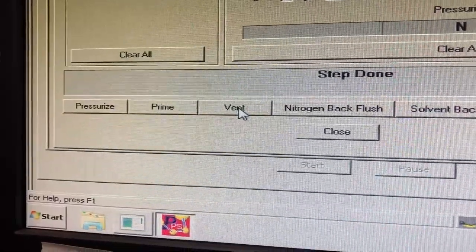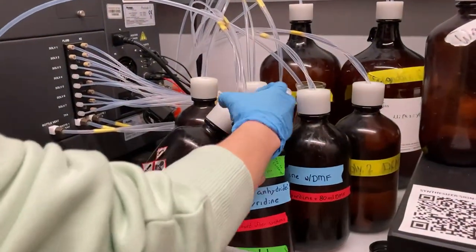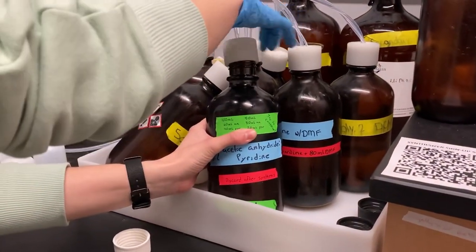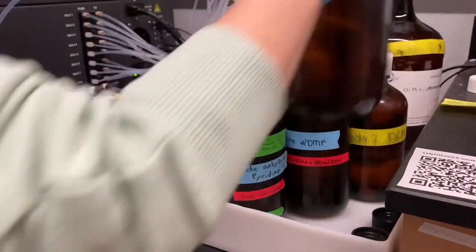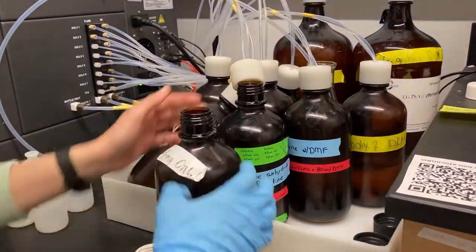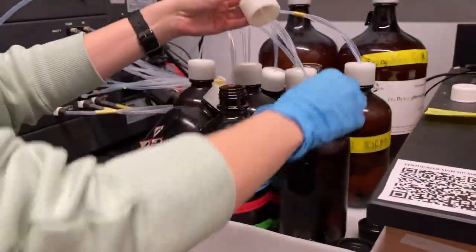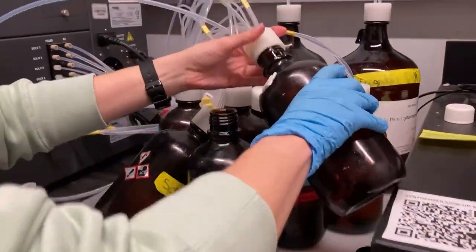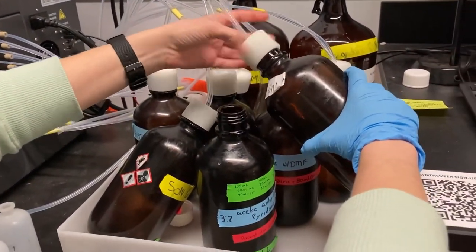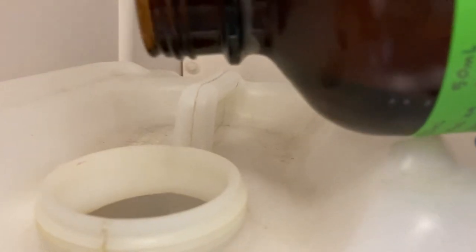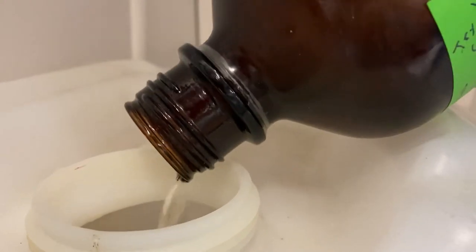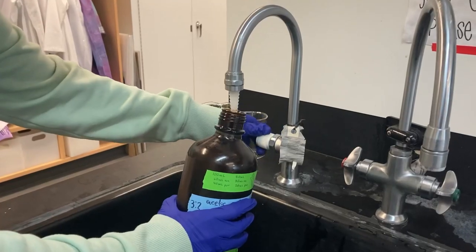Vent the capping reagent bottle and replace it with a wash bottle. Discard the remaining capping solution and rinse the bottle with water. Allow the bottle to dry with the lid off.